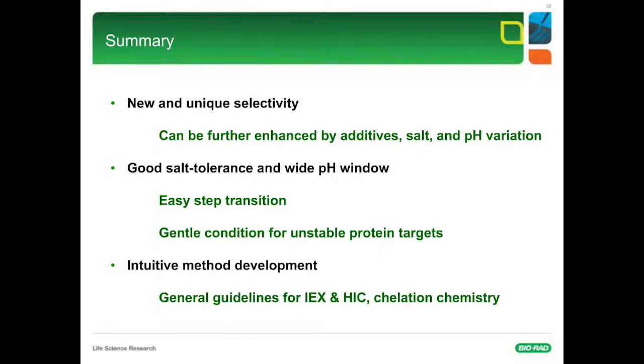The method development is quite intuitive. All guidelines you learn for ion exchange chromatography, hydrophobic interaction chromatography, and chelation chemistry still apply. So we can gain knowledge during method development, and we can refine the purification condition based on our knowledge from this exercise. And I hope with all this information I give you today, you get a better picture about mixed mode chromatography.